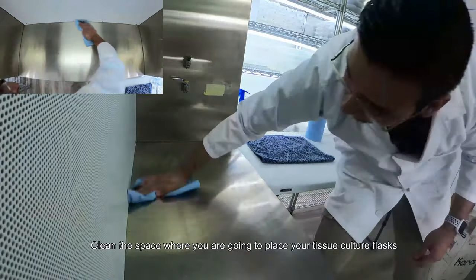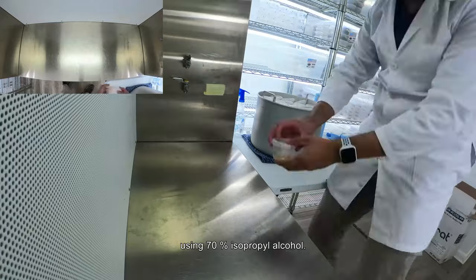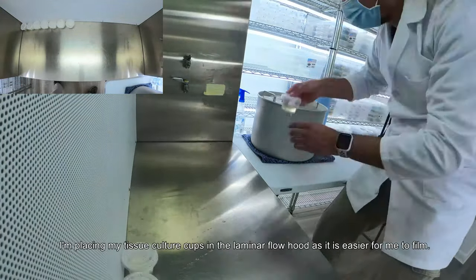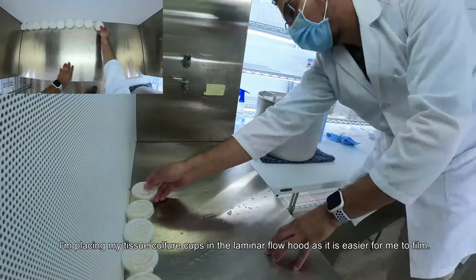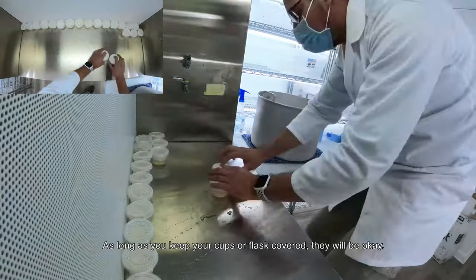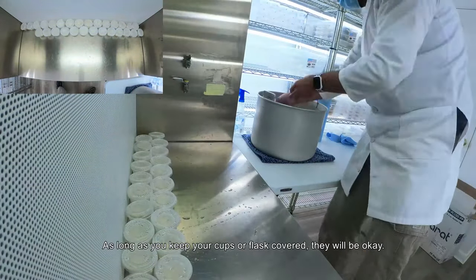Clean the space where you are going to place your tissue culture flasks using 70% isopropyl alcohol. I'm placing my tissue culture cups in the laminar flow hood as it's easy for me to film. However, you can use a table or a countertop if you are in the kitchen. As long as you keep your cups or flasks covered, they will be okay.